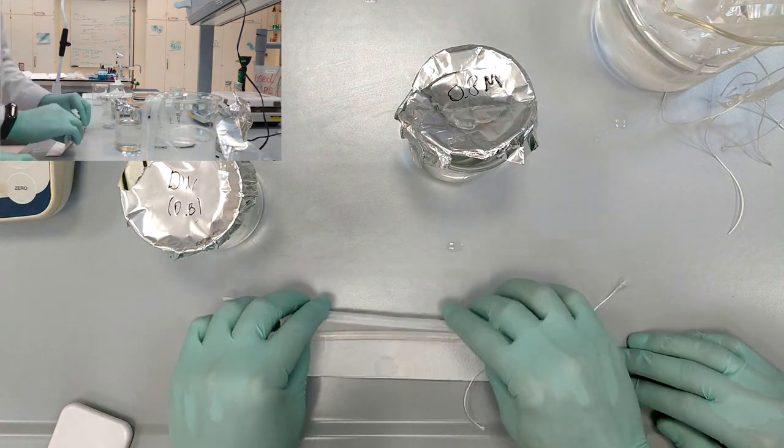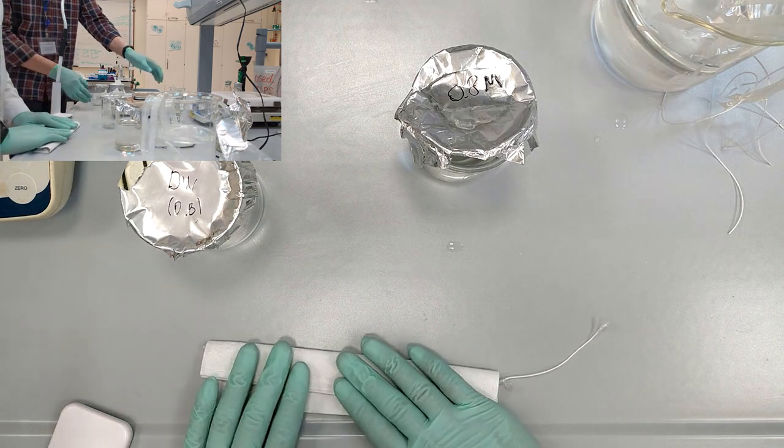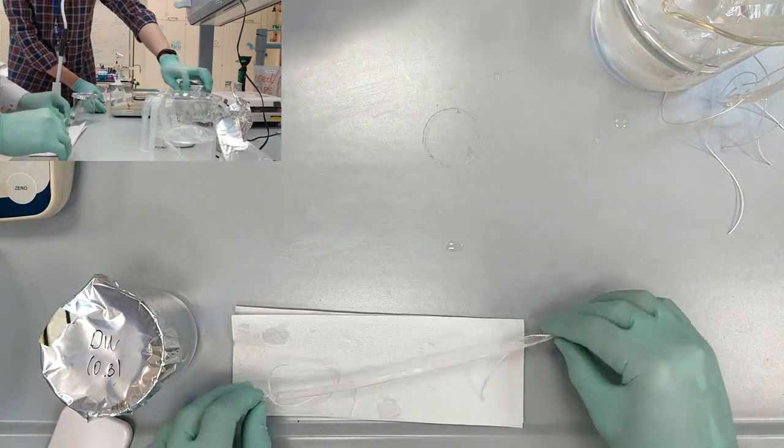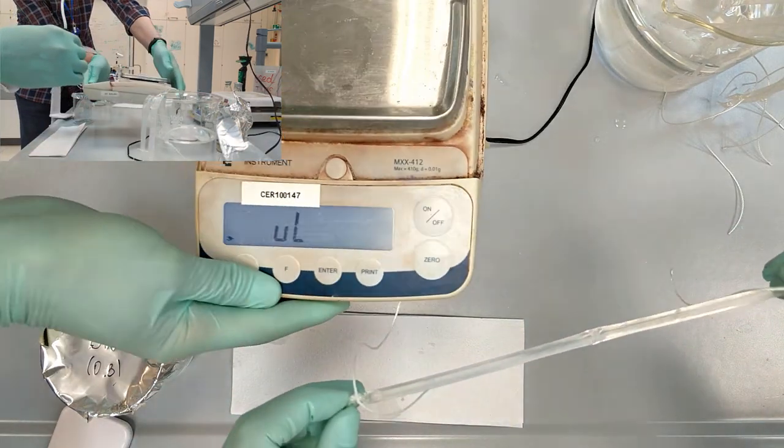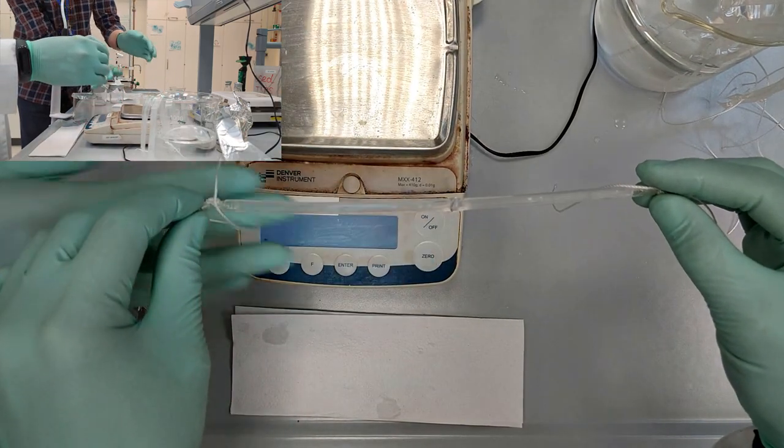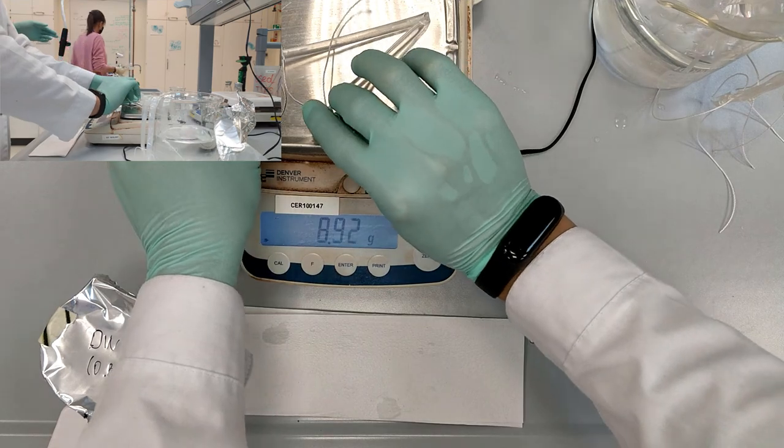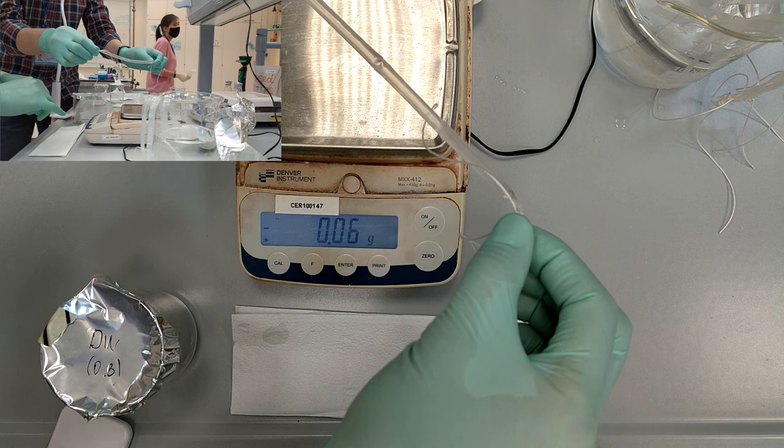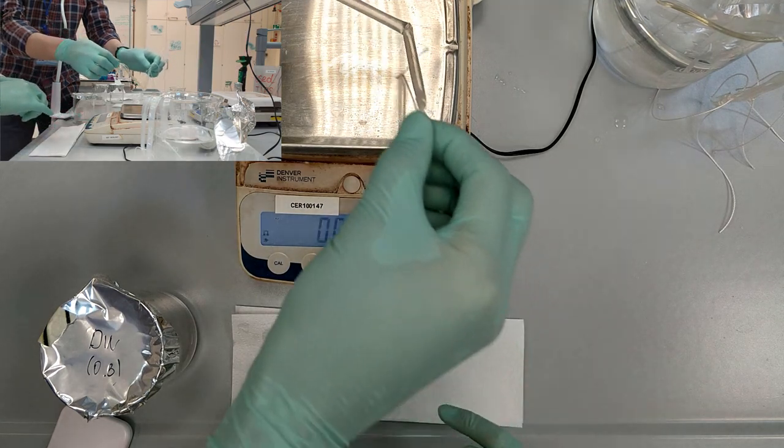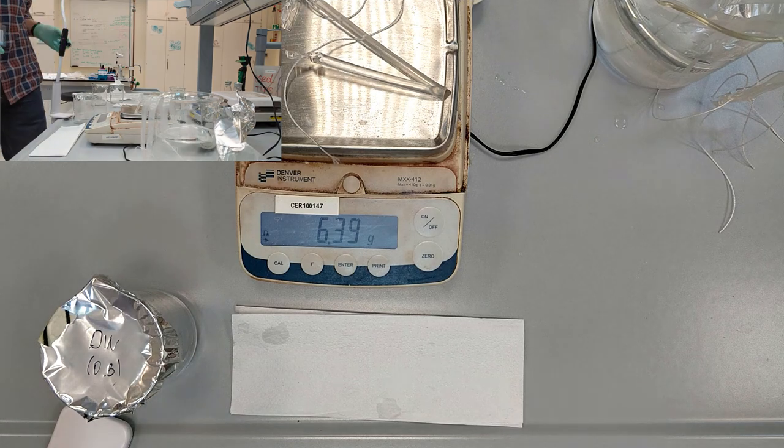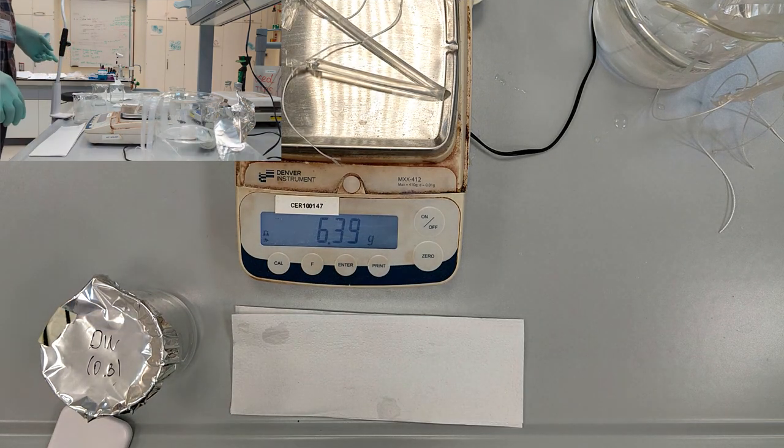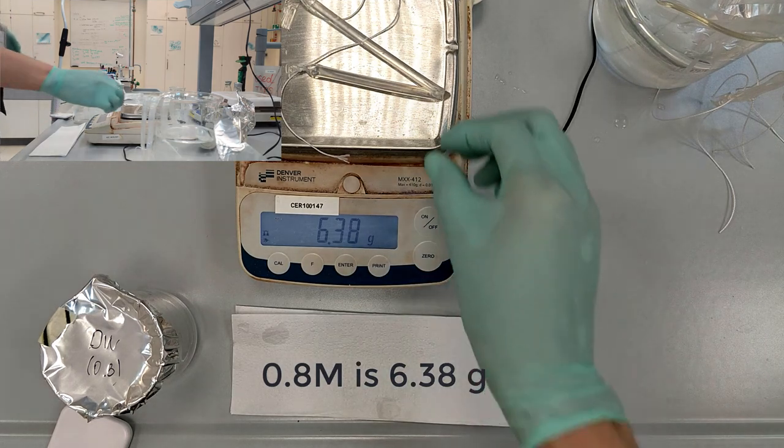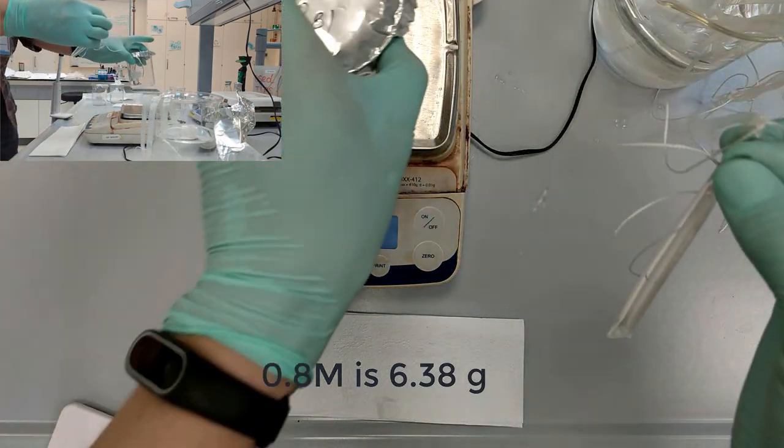Dry the dialysis tube and using scales determine the mass. In this case you will need to zero the level. Wait until it shows zero. Okay, so for 0.8 concentration you have 6.38 grams of the dialysis tube.